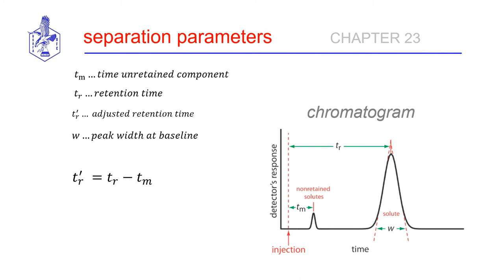The critical parameters that we want to measure when we carry out a sample separation are as follows. Okay, here we have our mobile phase substance. Okay, it's flowing in this direction. Okay, we are going to introduce our sample by injecting that sample into the flow of the mobile phase. The mobile phase is going to be carried down onto our column.